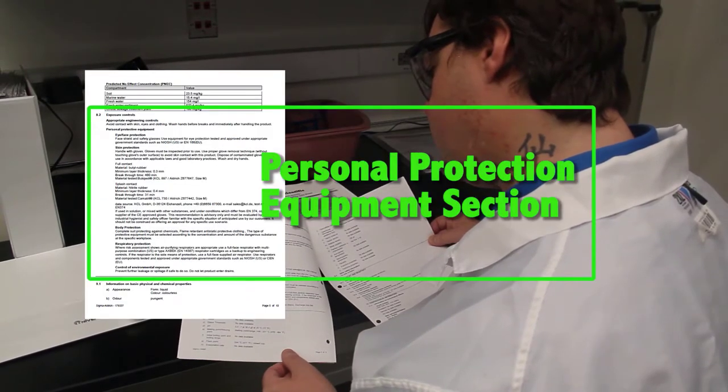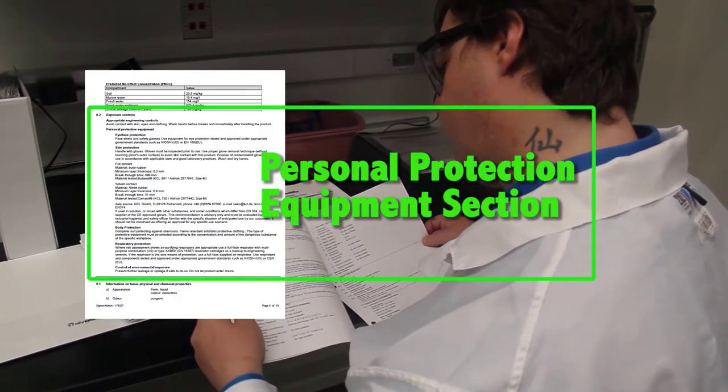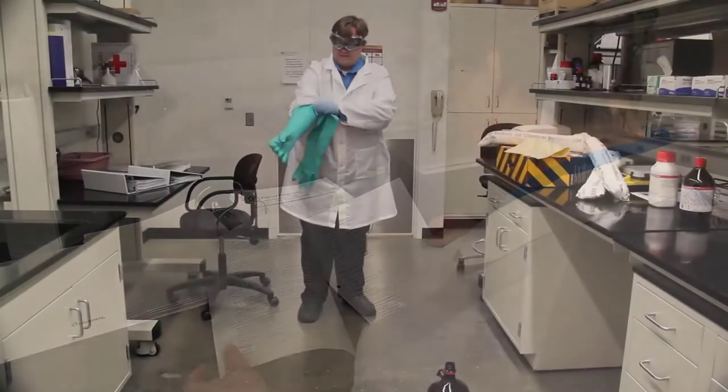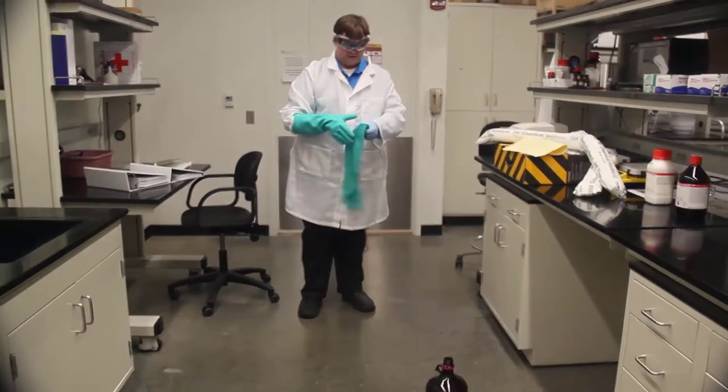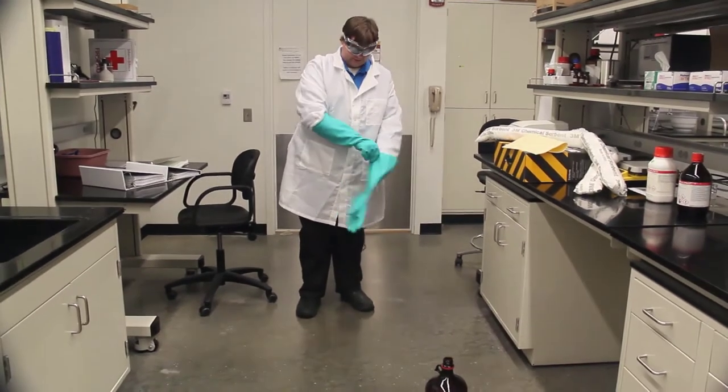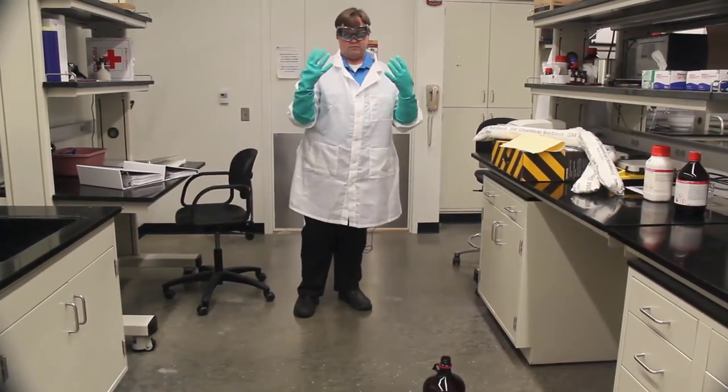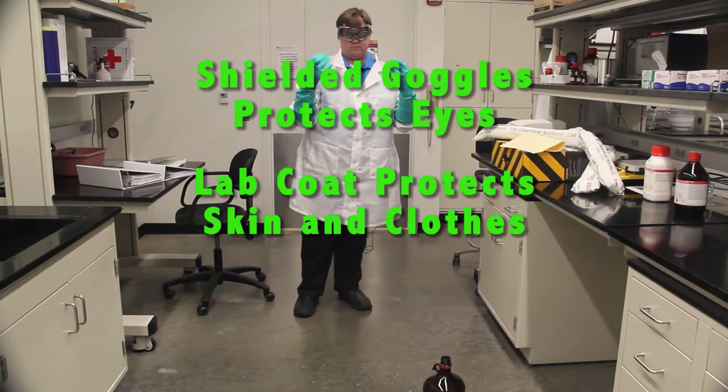Other sections provide information on the personal safety equipment required and first aid measures to apply in case of exposure. This SDS indicates that when coming into direct contact with this chemical, heavy duty gloves are required. Shielded goggles and a lab coat must be worn as well.